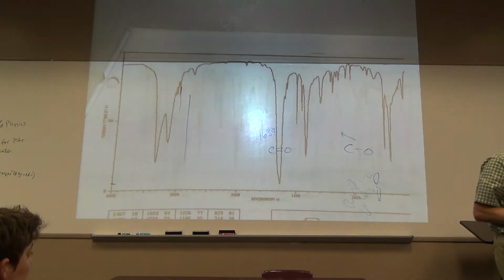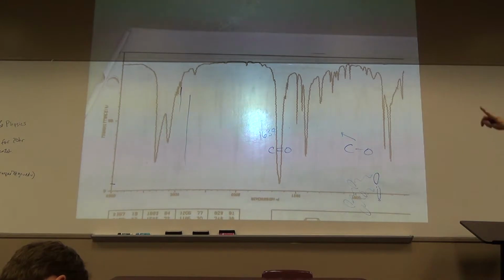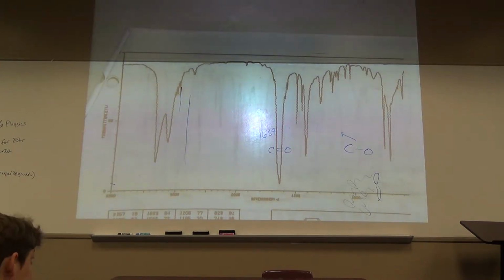There is one that looks like the 2800 or 3. That little blip, I guess, is almost too far to the right to be CH. I would like to see something right at the edge. So in the end, it's a little bit atypical. It's almost like it was run upstairs, where everything is a lot weaker.